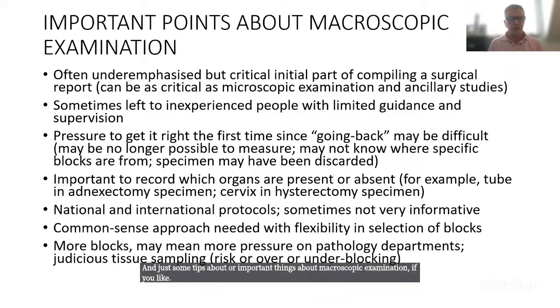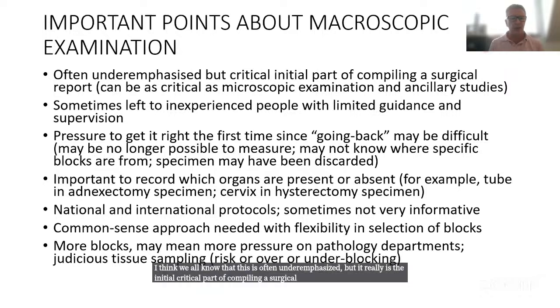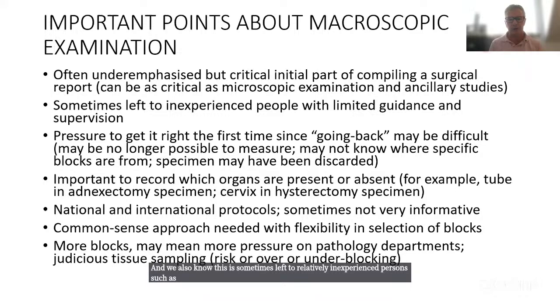I think we all know that this is often underemphasized, but it really is the initial critical part of compiling a surgical pathology report, and it can be just as critical as microscopic examination and ancillary studies. We also know this is sometimes left to relatively inexperienced persons, such as pathology trainees, and sometimes there's limited guidance and supervision. There is some pressure to get it right the first time, since going back may be difficult. For example, it may no longer be possible to measure something. You may not know where the specific blocks have been taken from. And even if it's sometime later, the specimen may even have been discarded.